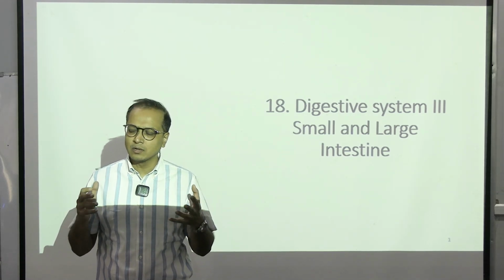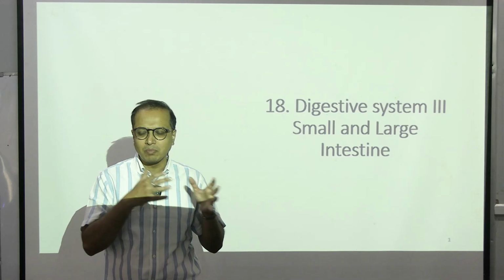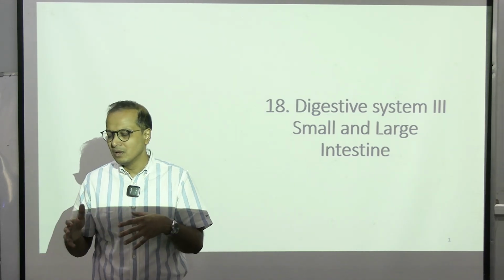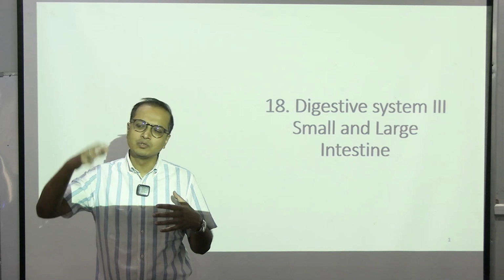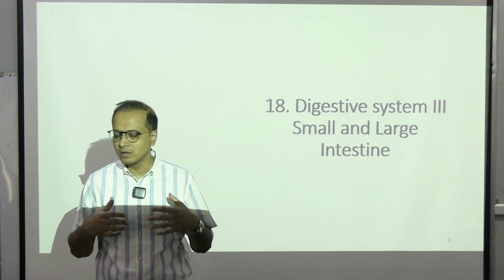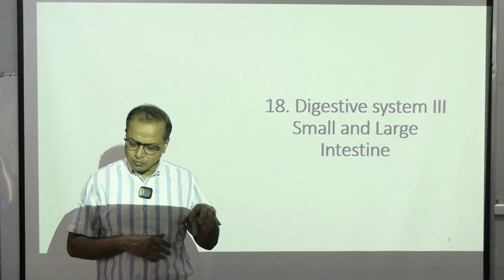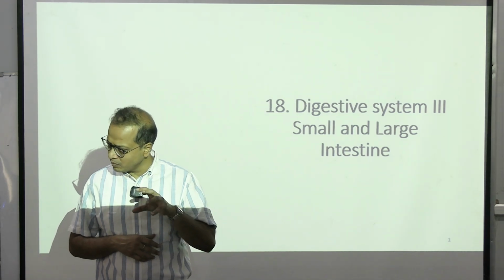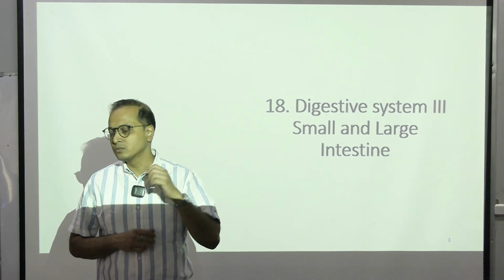So we are not going to make it difficult for ourselves by remembering what it looks like in different parts, because we are going to learn the gross things first, and then we have years to go through this, like a medical curriculum. Slowly we will learn that. But at this point we just want to have a grasp of the basic things, which we are not going to forget. So this is what we are going to see.